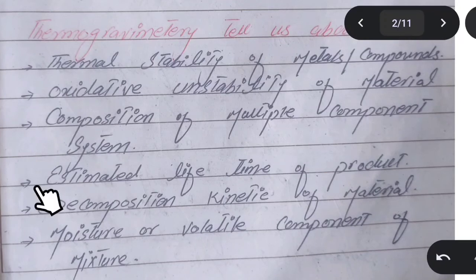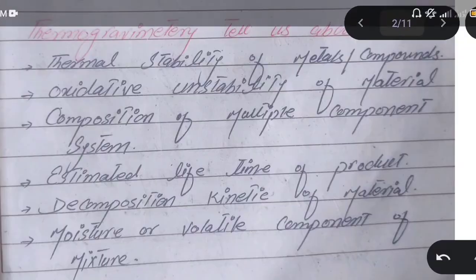Let's say, for example, if I heat up a substance X, it will be converted into Y, and how long Y will survive, and at which temperature it will be converted into Z. That is the actual meaning of this sentence. Decomposition and kinetics of a material. Kinetics refers to the speed of a reaction, how much time it requires to be complete.